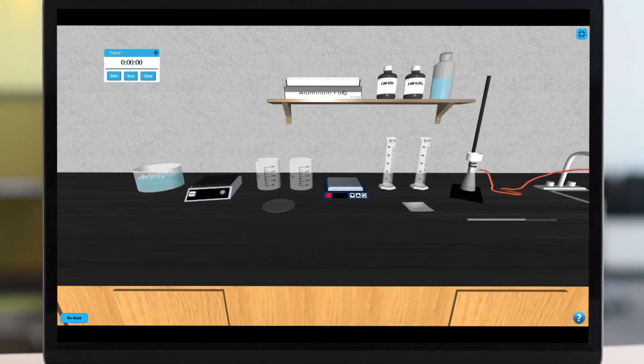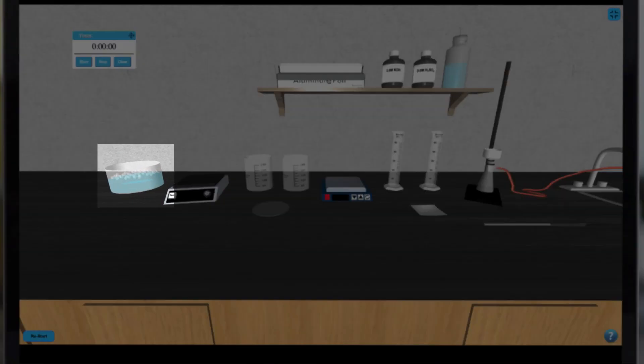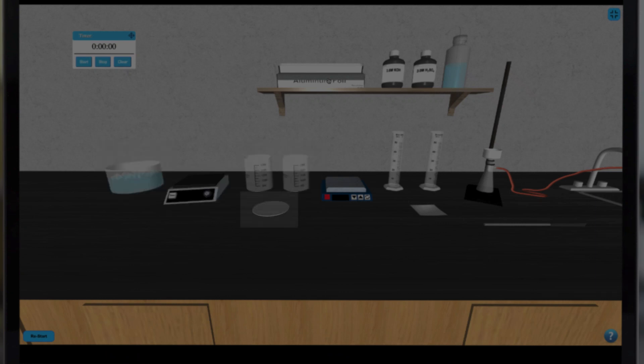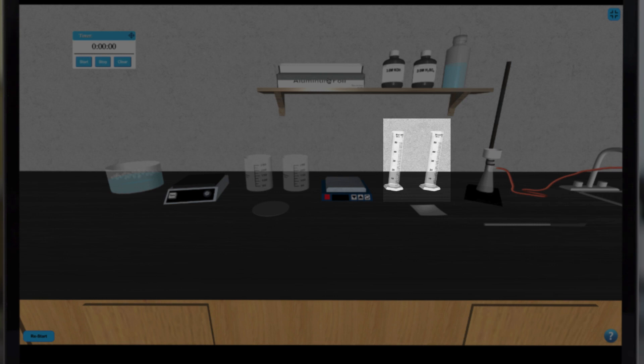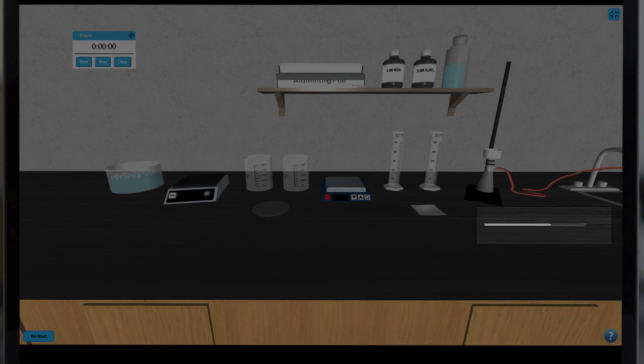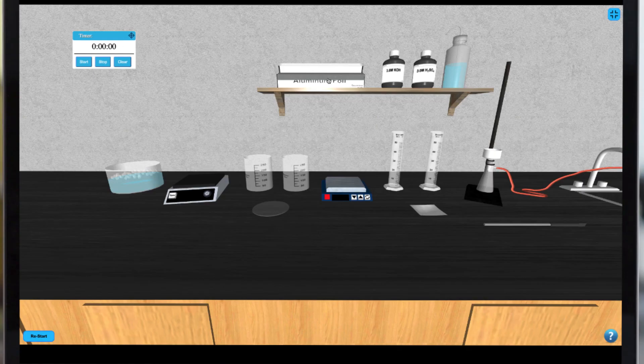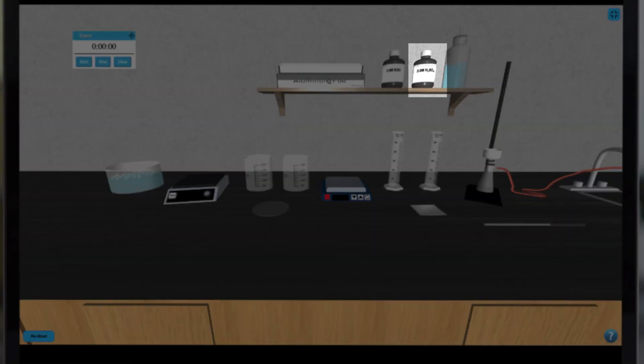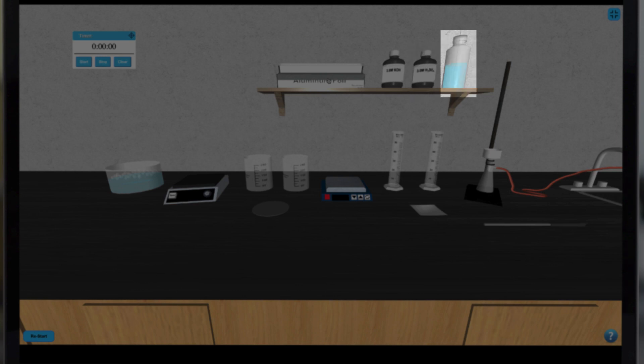In this simulation we have an ice bath, a balance, two beakers and a watch glass, a hot plate, two graduated cylinders, filter paper, a Buckner funnel, and a glass stirring rod. On our shelf we have aluminum foil, potassium hydroxide, sulfuric acid, and some water.